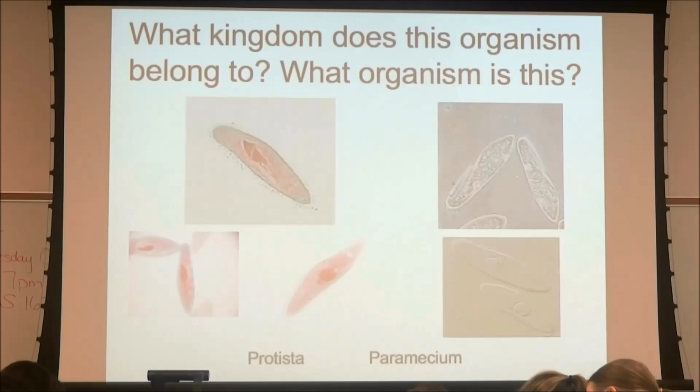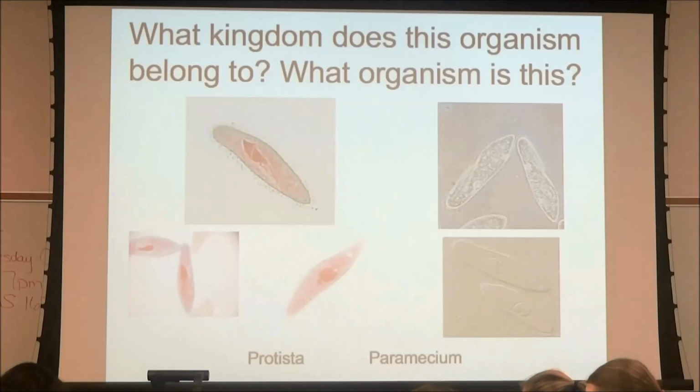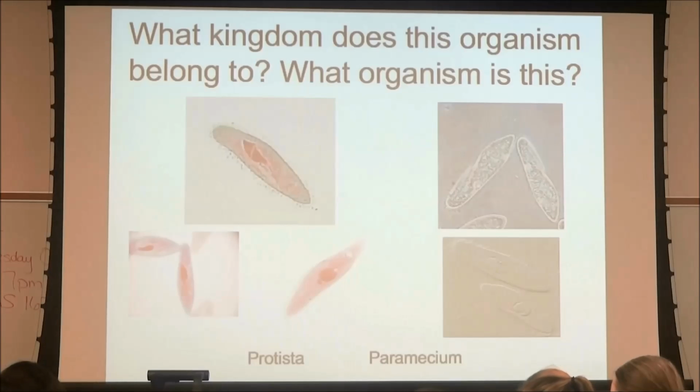There's one more thing, guys. The big thing in the middle. The macronucleus. Okay? Now, don't confuse this with euglena because they look pretty similar, right? At least the preserved ones do. These guys have a macronucleus. The nucleus is much, much bigger.